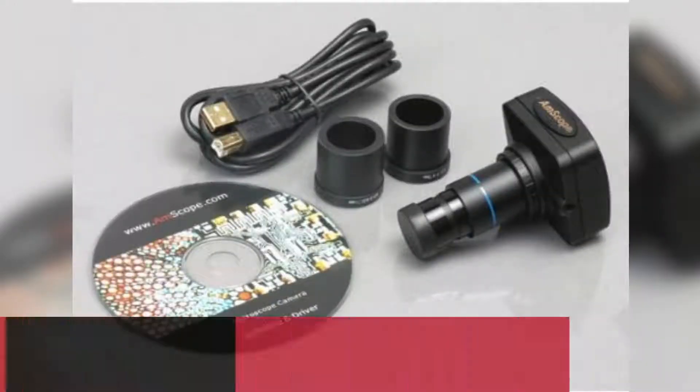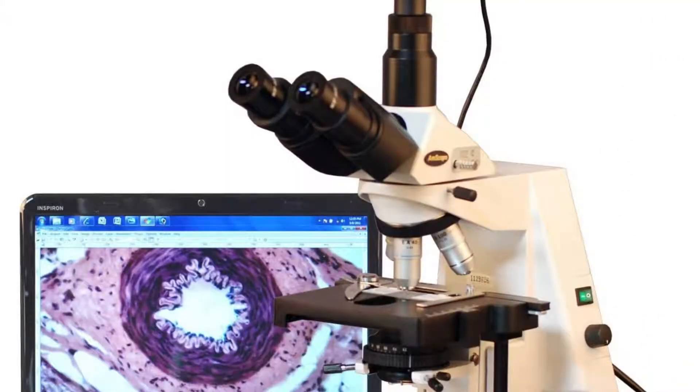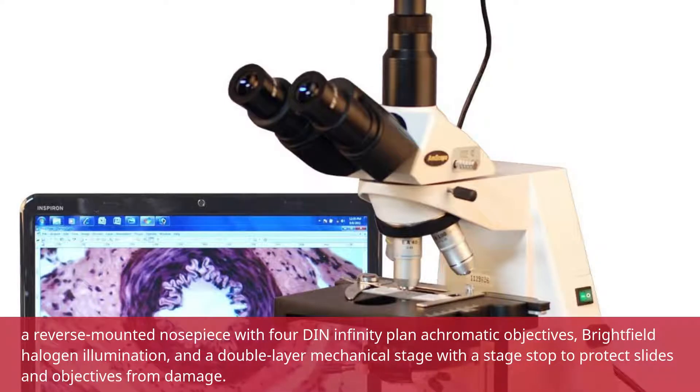The AmScope T690C-PL8M Digital Compound Trinocular Microscope has a Siedentopf Binocular Mount with interchangeable pairs of 10x and 25x Super Widefield Eyepieces, a reverse-mounted nose piece with 4 DIN Infinity Plan Achromatic Objectives, Brightfield Halogen Illumination, and a Double Layer Mechanical Stage with a stage stop to protect slides and objectives from damage.